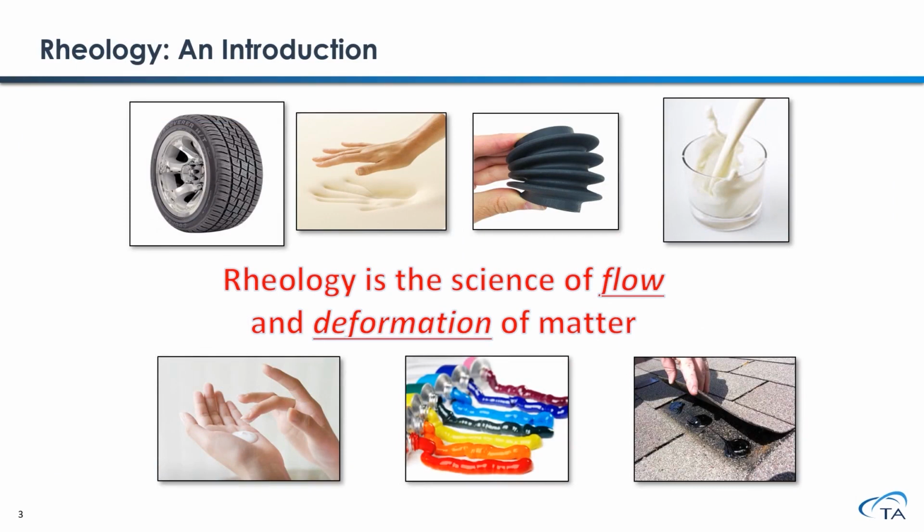First of all, what is rheology? The fundamental definition is that rheology is the science of flow and deformation of matter. Specifically, rheology studies the relationship between a given deformation and the stress response of the material that's being measured.